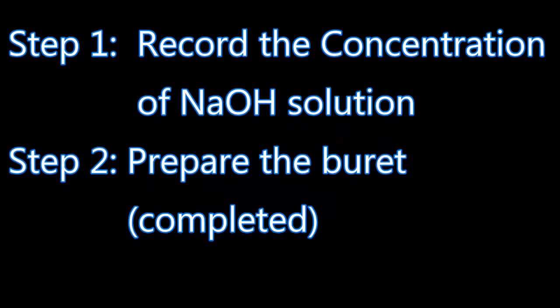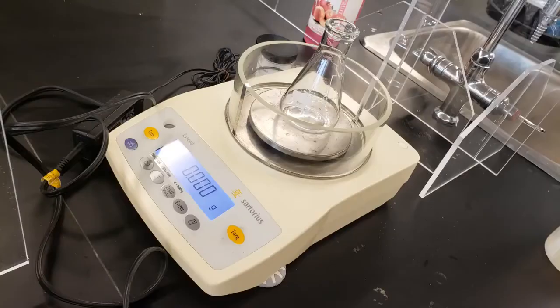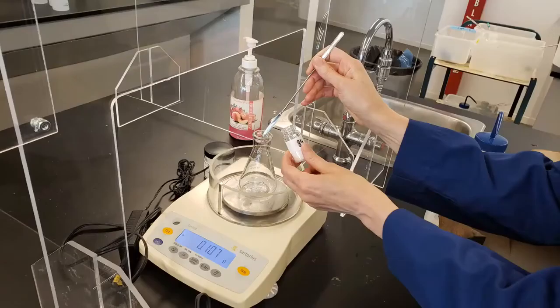Ensure the Erlenmeyer flask is clean and that its outside is dry. Put it on the balance, wrap your finger in a paper towel before pressing the tare button, weigh between 0.100 grams and 0.115 grams of the assigned unknown acid directly into the Erlenmeyer flask. Record the mass of acid used in the table provided.